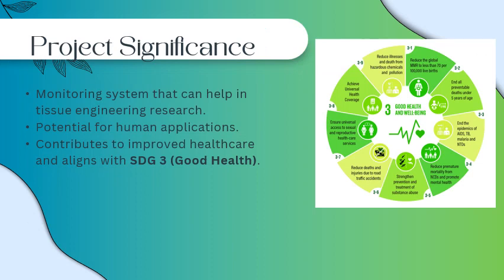This project is in line with Sustainable Development Goal number 3, which is related to good health, where the output of the project is a lab-based instrument system that can monitor the skin condition, which can help tissue engineering research.